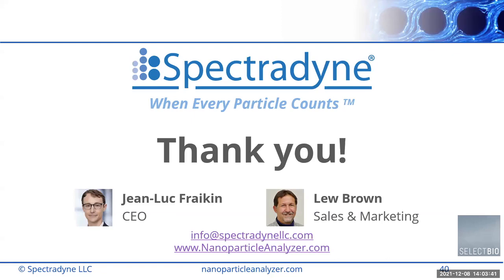All right. And then the final question is about the operating cost of the device, because you have to buy a cartridge per sample. So what would be the range? Let's say that I have 20 samples to measure, the operation cost other than the equipment cost. Yep, good question. So cartridges are $9 each.